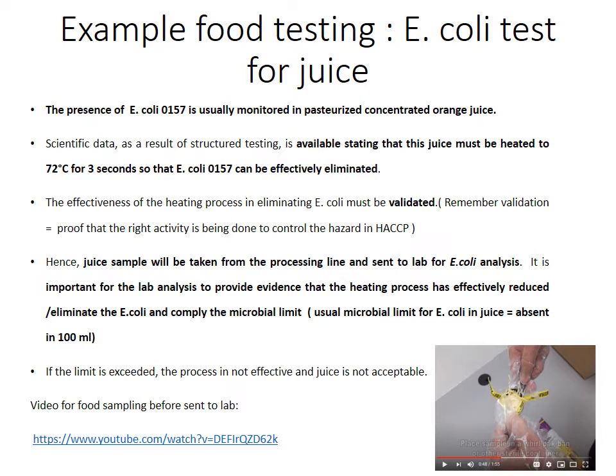Maksudnya untuk kita membuktikan bahawa proses pasteurization kita telah berjaya menyingkirkan E. coli, kita kena tunjukkan melalui microbiological test that dalam jus kita tak ada E. coli in 100 ml sample. If this is proven through the microbiological analysis results, then your pasteurization is considered effective and your product is declared safe.